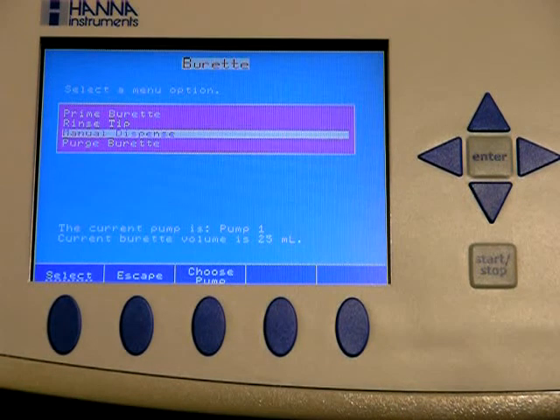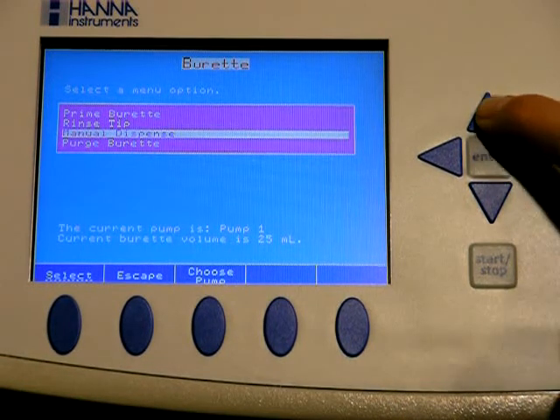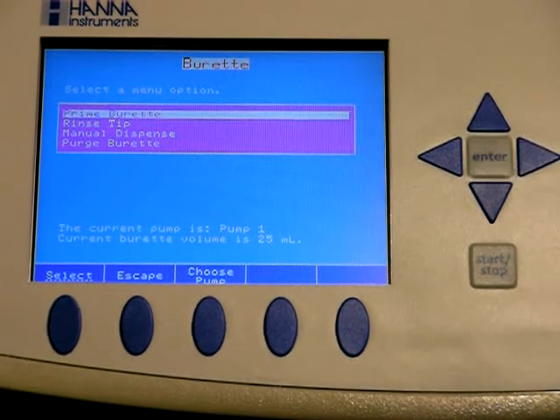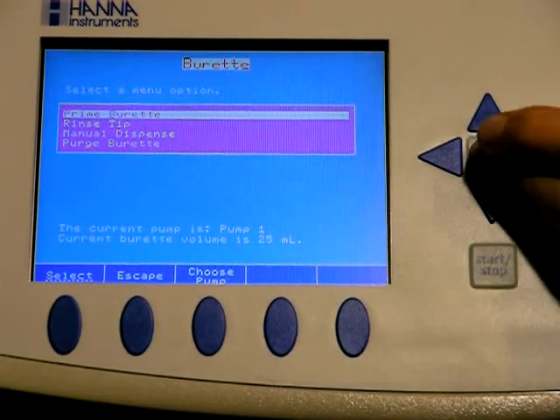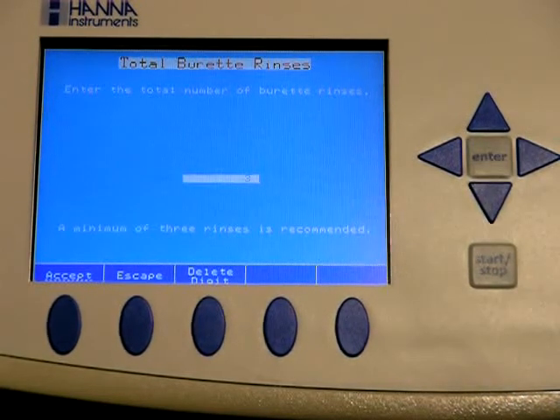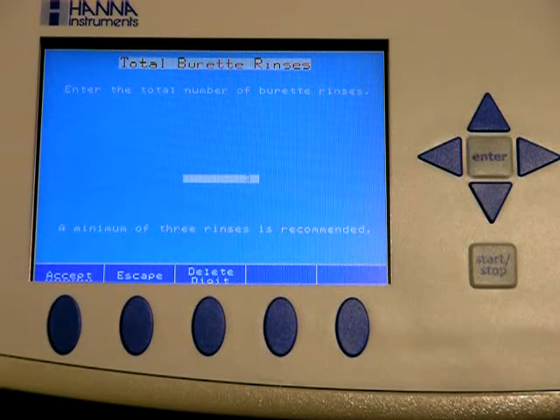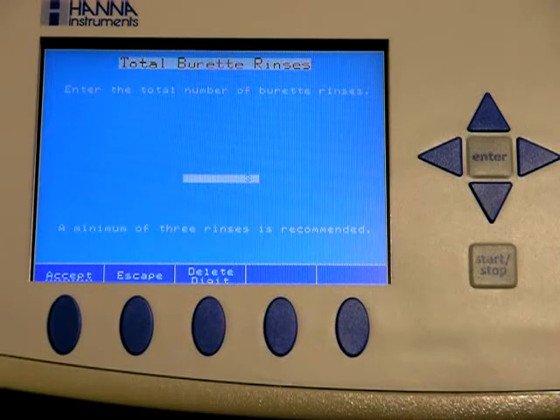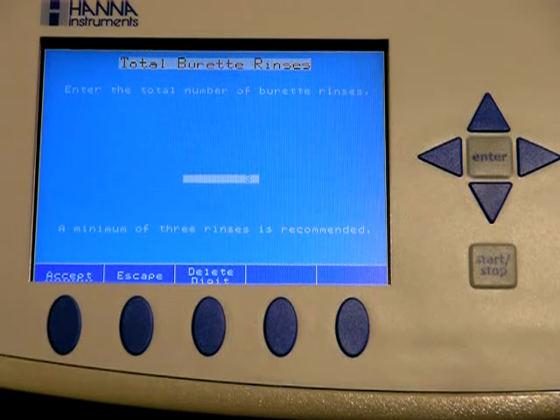You enter that, you'll have four choices. The top choice, prime burette. This is when you're changing out a reagent or running a clean cycle, running some deionized water through your pumps. In between reagents, you can choose between one and five. Three is recommended.